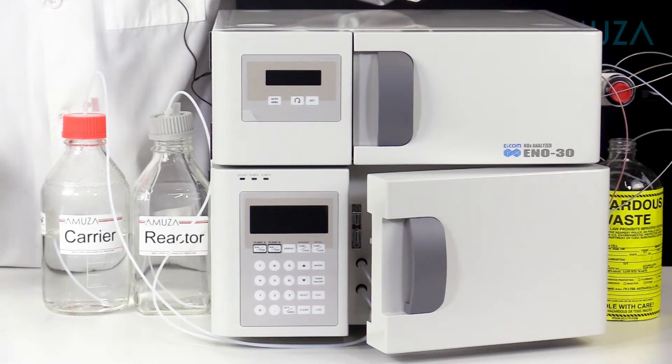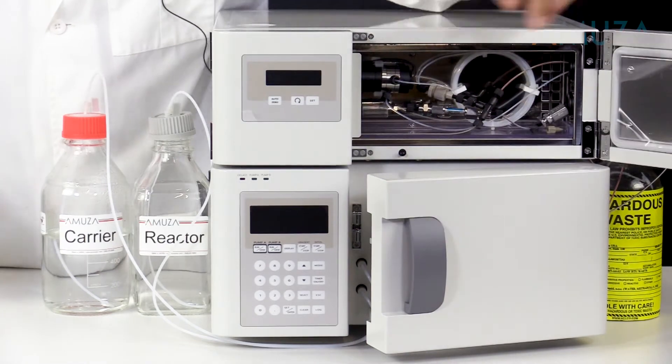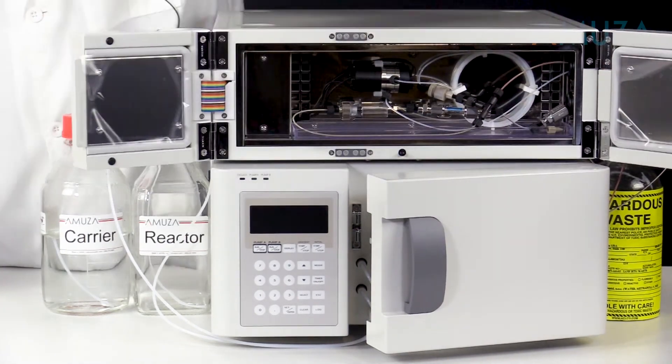Both nitrate and nitrite are first separated by retention time with an HPLC column.